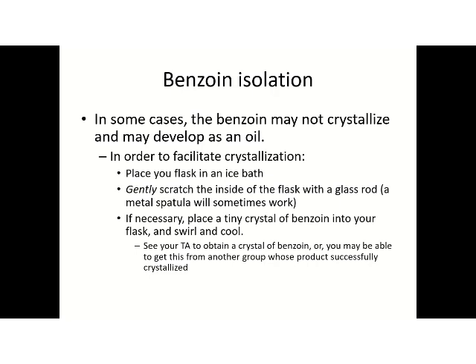So, all this will contribute to the crystallization, which means that we will get the product more pure if we get the crystals, right? If we introduce a nucleus of a crystal, from this nucleus the crystal is going to start growing, right? And as a consequence, we are going to generate more similar nuclei of that crystal, which is what we want in order to get a more pure product.